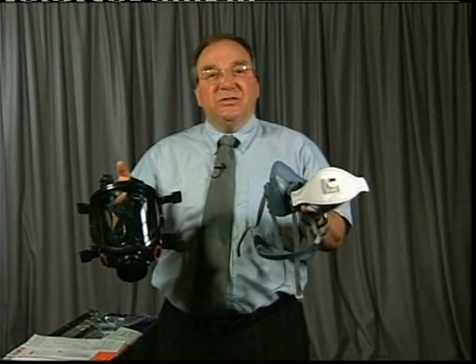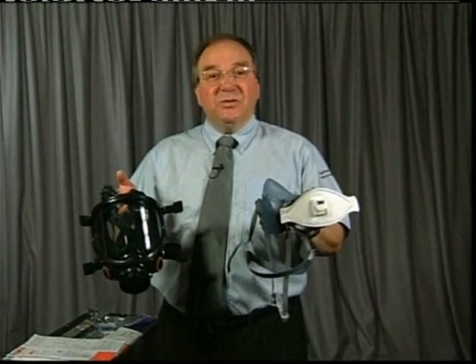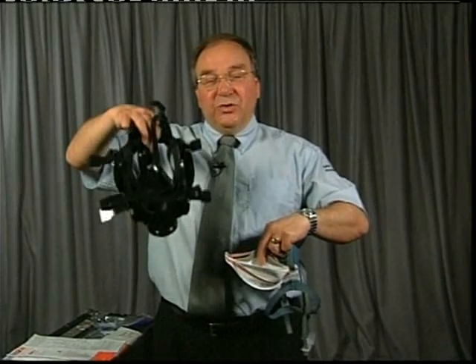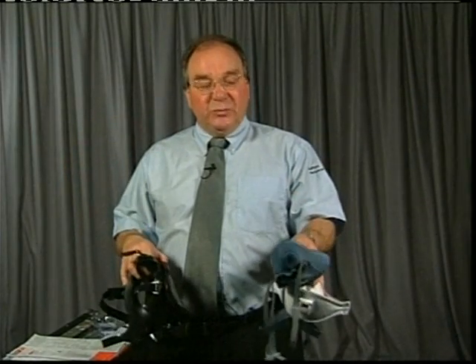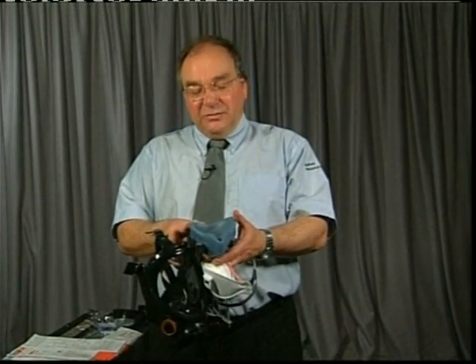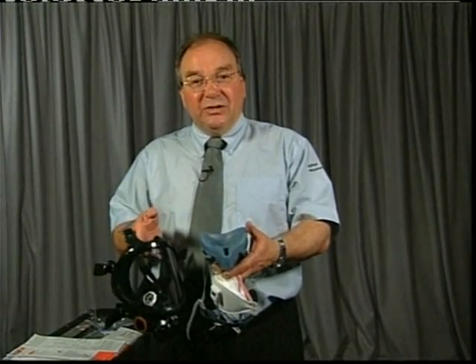Something that has to be taken into consideration is facial hair and beards. If you have facial hair, none of these masks will fit properly because the facial hair breaks the seal on the mask — whether it be a full face mask or a disposable. As soon as you try to wear this with facial hair, even light stubble, it can greatly break the seal and depending on the environment could be hazardous to your health.